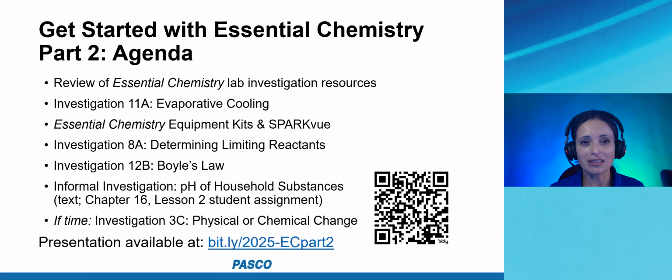Here's our agenda. We're going to review the Essential Chemistry lab investigation resources. The first few minutes might be a repeat if you just attended Part 1, where I'm going to show how to get the Essential Chemistry lab programs in Portal and education.pasco.com. Once I go through that, I'm going to move on and just focus on the labs.